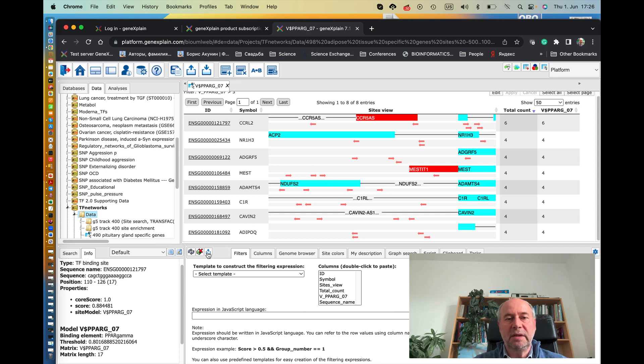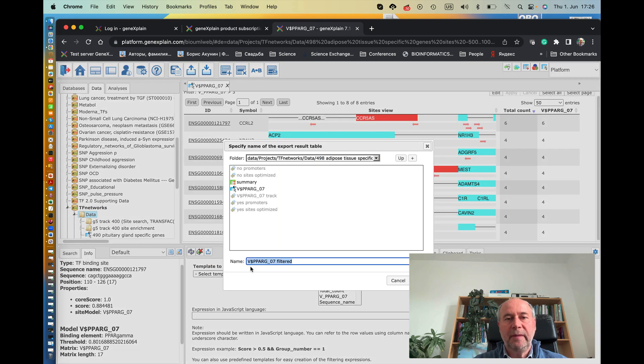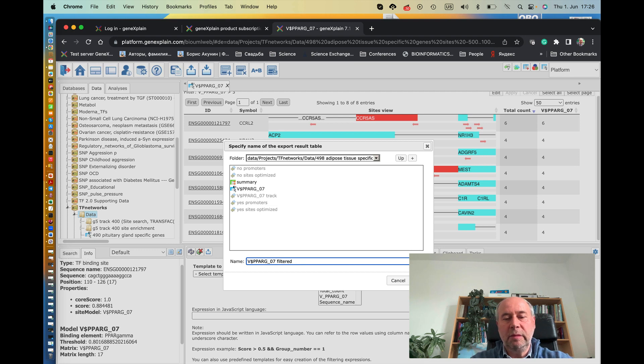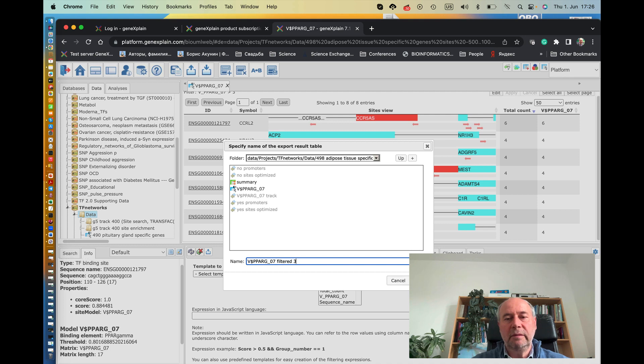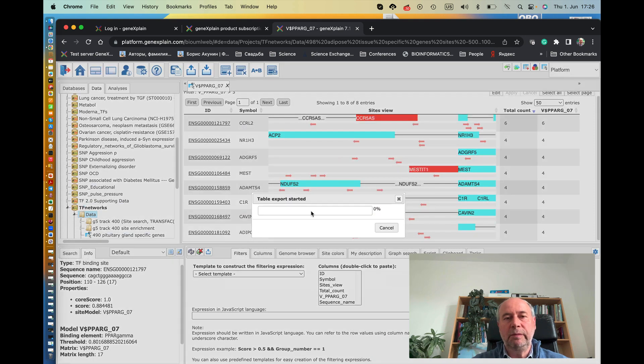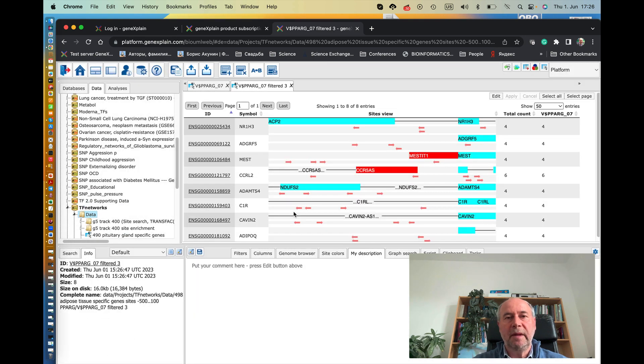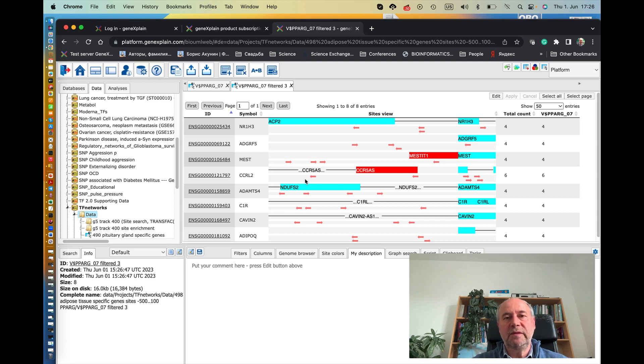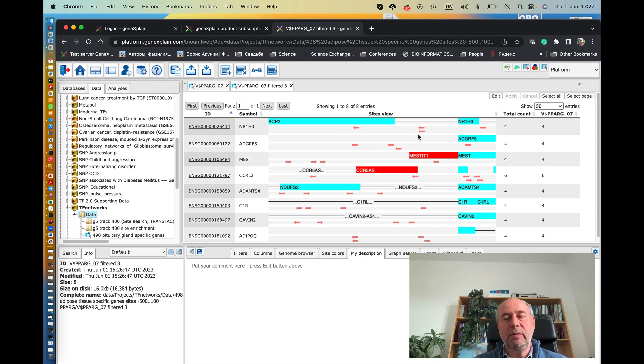So we can save this set of genes as a special set. So we can say these are filtered by more than three, and press okay. So these are your adipose tissue-specific genes which are regulated by PPAR gamma and have a high number of binding sites in the promoter of these genes.